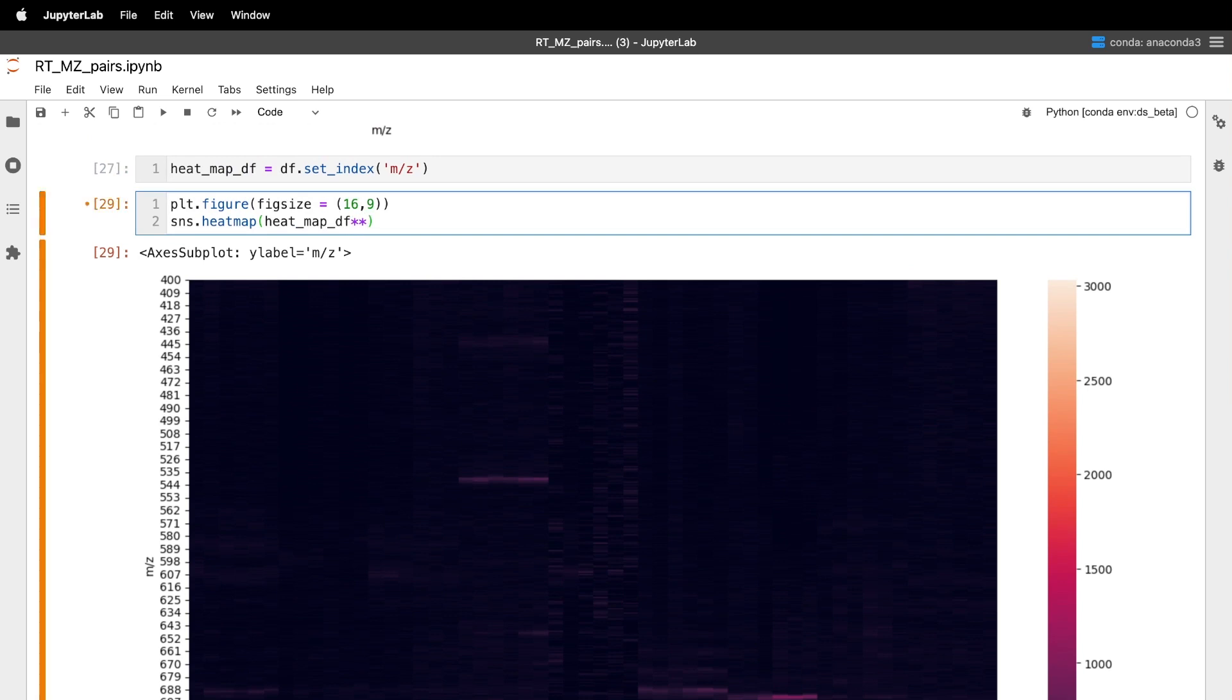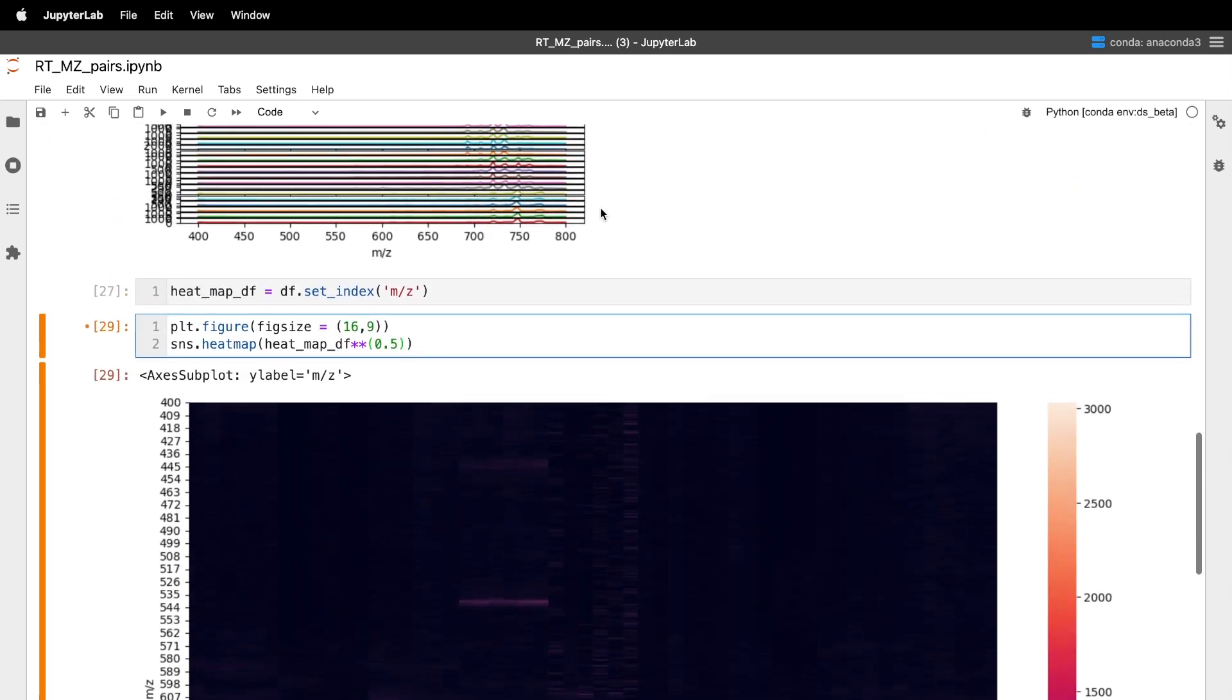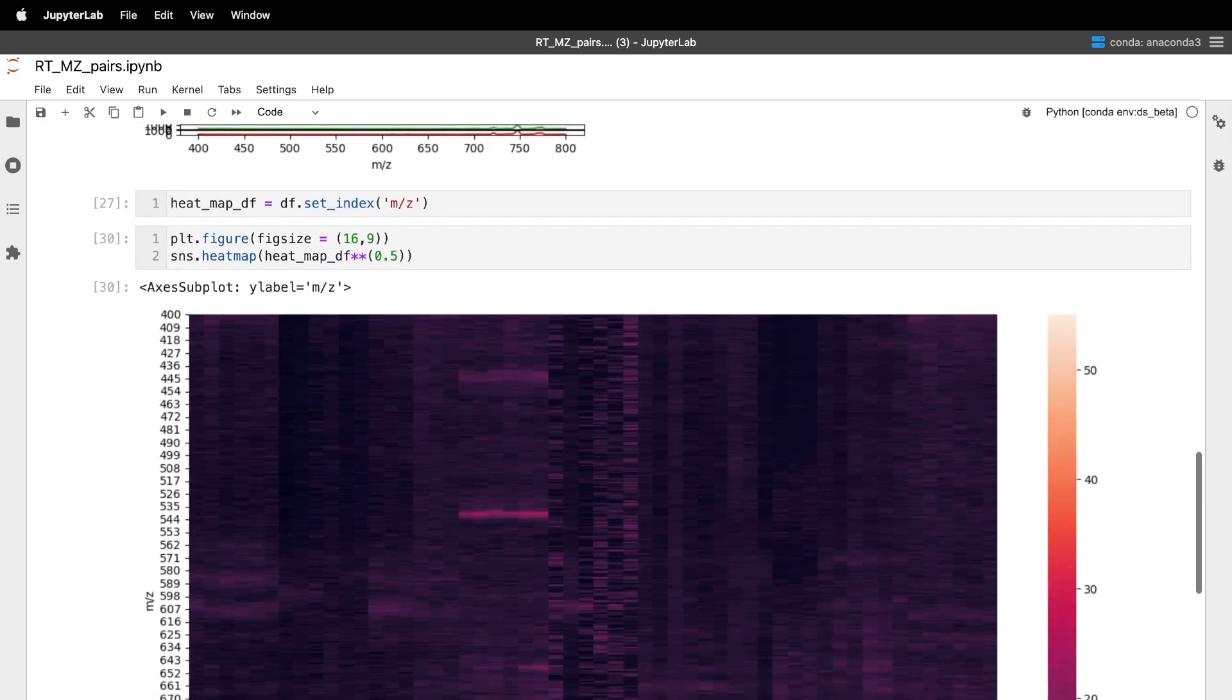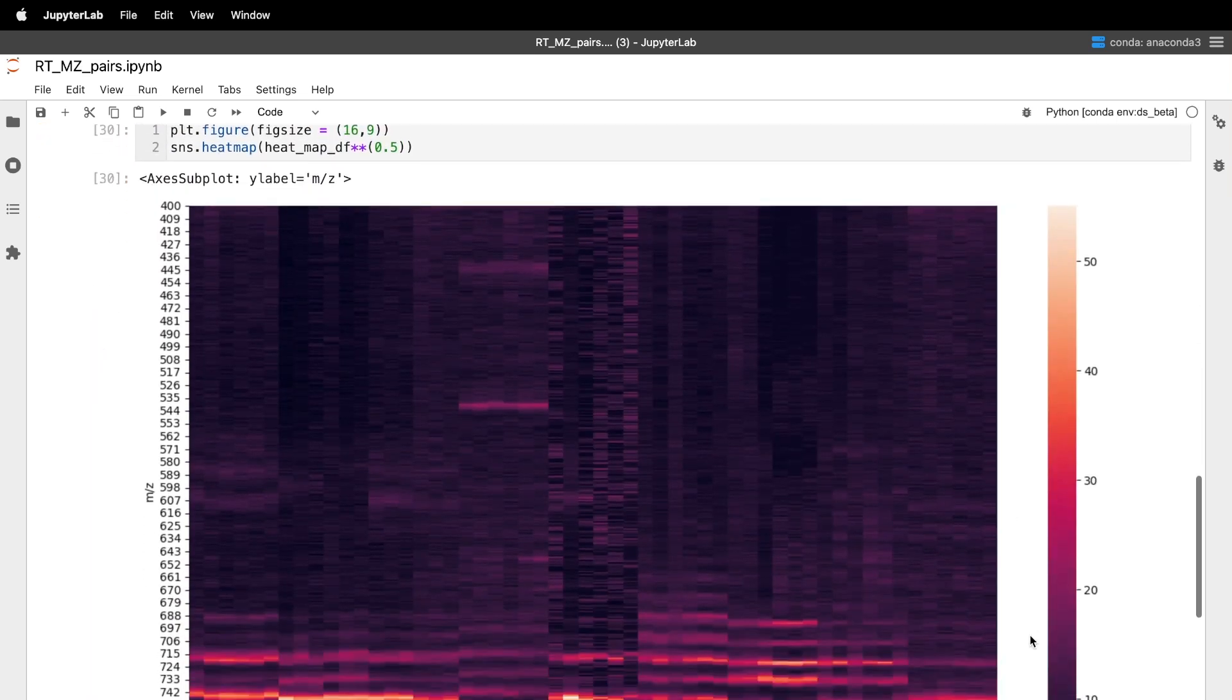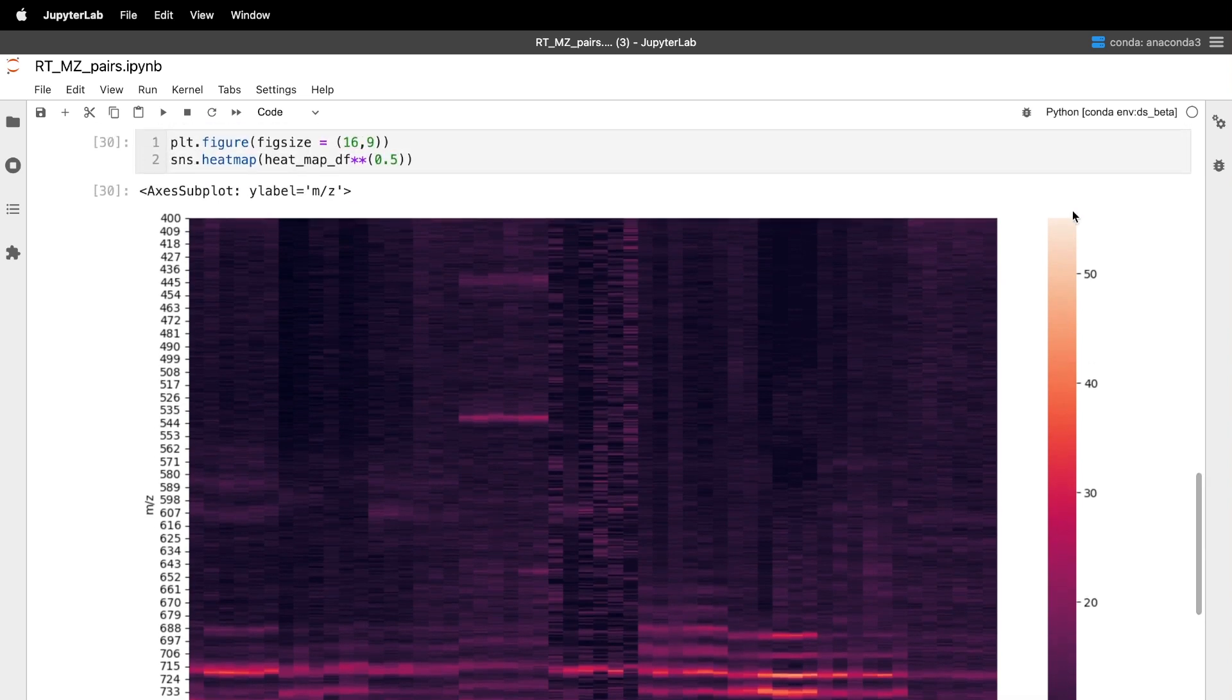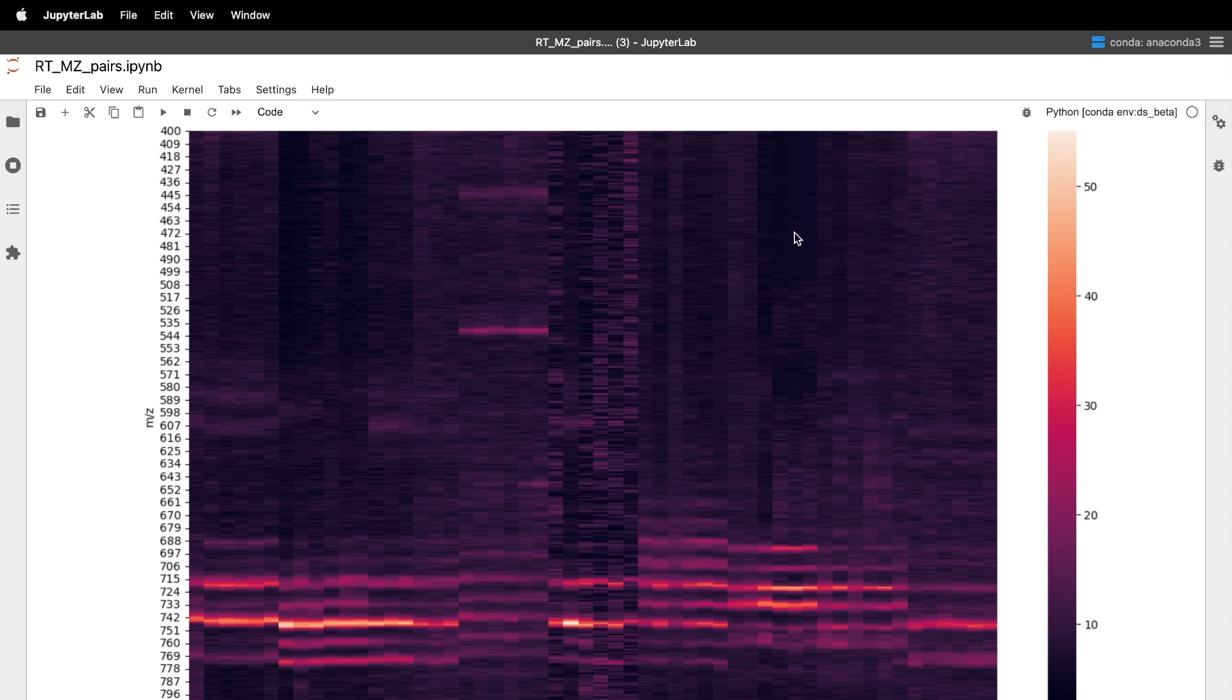Let's say I want to take the square root of all these points. And so the range is more compressed. So you can see here that the low value is near zero and the high value is near 3000 counts. And if we take the square root, you see that now our low value remains near zero, but the highest value is closer to about 60. And so through this compression, we can see more of these smaller signals as we have now reduced the overall range to be in a much smaller area.